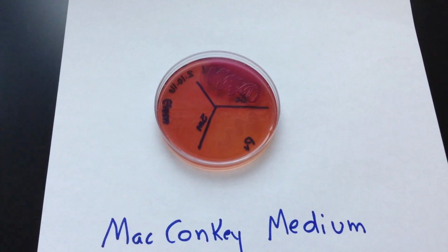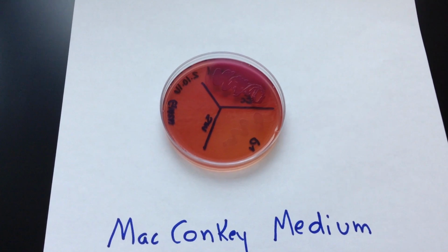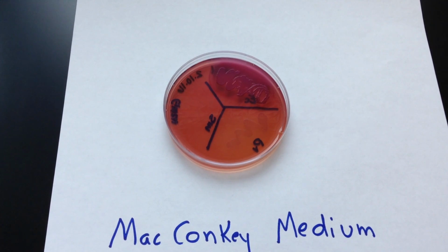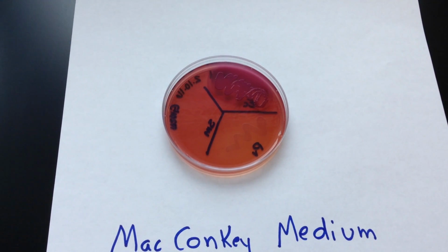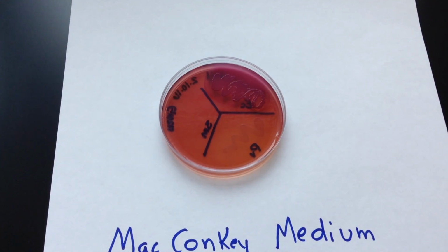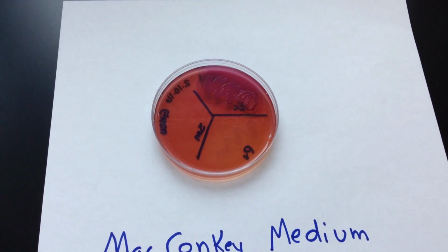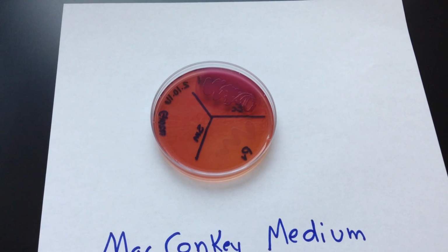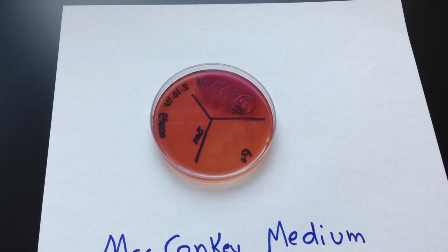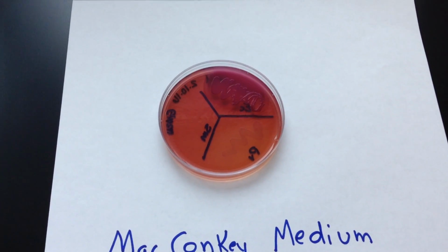So if the organism is growing in the medium, we can assume it's a gram-negative bacterium. So that's the selective aspect. The differential portion of the medium is due to the presence of the disaccharide lactose. If the organism can ferment lactose, it interacts with a pH indicator because when the fermentation of lactose occurs, the pH drops below 7. And the pH indicator in the medium is called neutral red. And that neutral red will turn a bright pink color.